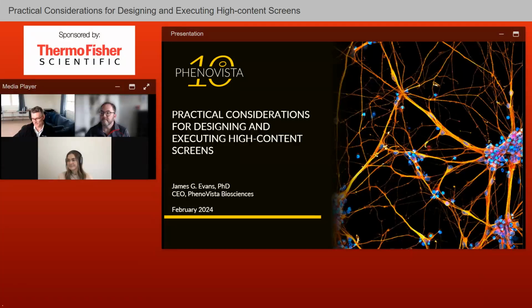Cell density will affect morphology, will affect how comfortable or resilient to stress the cells can be. And then it can also impact less relevant but still important aspects. As the cells get too dense, you start having cells detach in some cases or forming 3D structures that make imaging more challenging. So cell density is one of the very first aspects of assay optimization that our scientists will tackle.